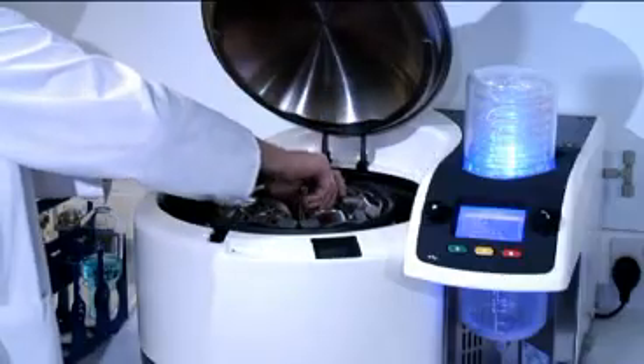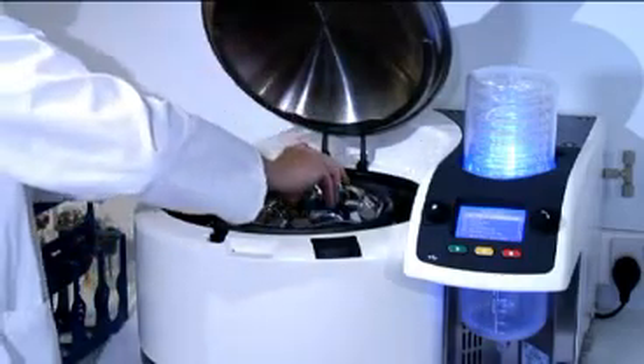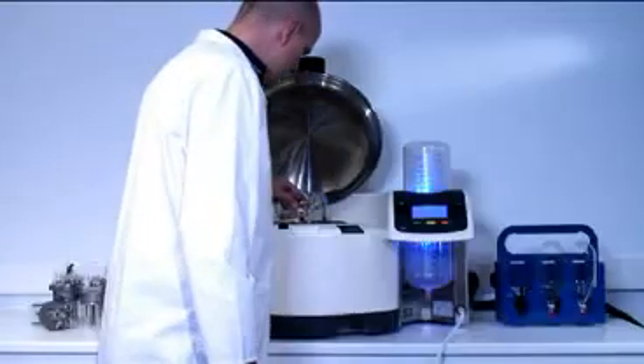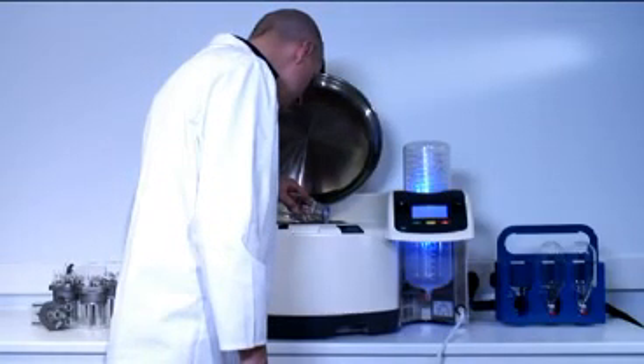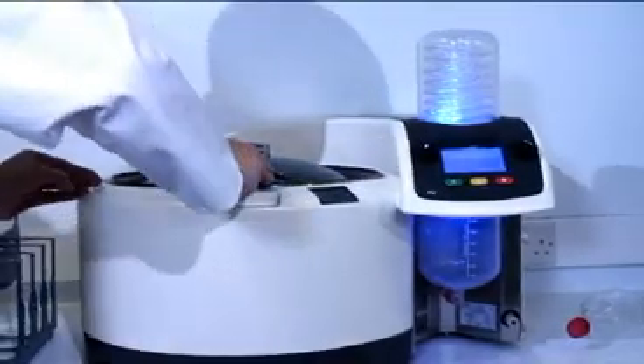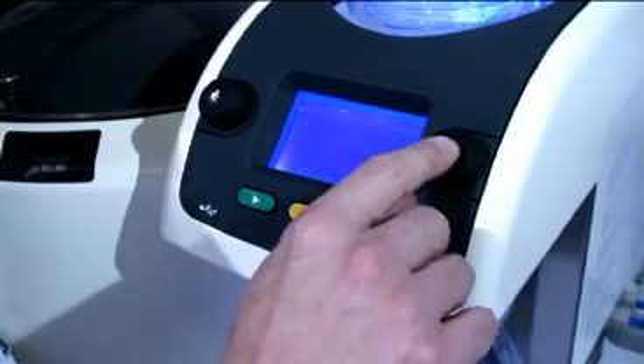Using the Rocket is simple. Load your flasks or pucks of tubes into the rotor. Secure the inner lid. Check the water level — in normal operation, the Rocket will need an addition of less than 50 millilitres of water per day. Close the outer lid and select the appropriate method. Set the maximum safe temperature for your samples and hit start.